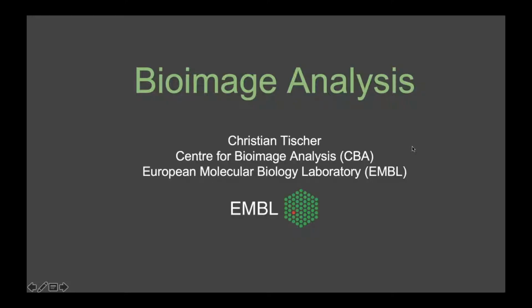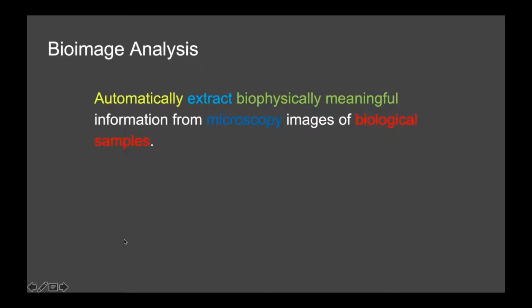Very good, thank you. So my name is Christian, as has been mentioned, and I want to give a short introduction to bioimage analysis. So what is bioimage analysis? Actually, it's a kind of new thing. So one could say it's a developing field in computer science, and I tried in the next slide to give a kind of definition, which is always hard, but I think one could say bioimage analysis is about automatically extracting biophysically meaningful information from microscopy images of biological samples.